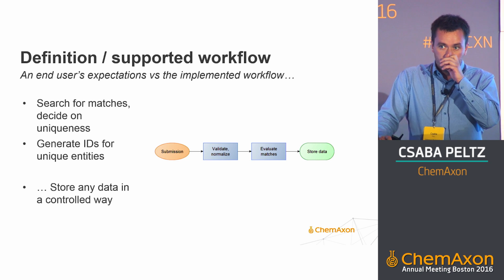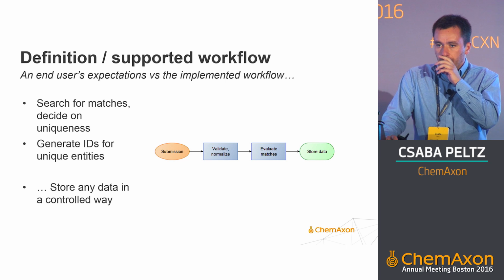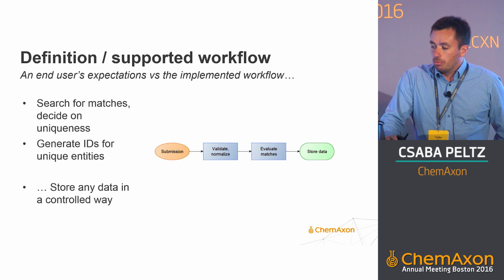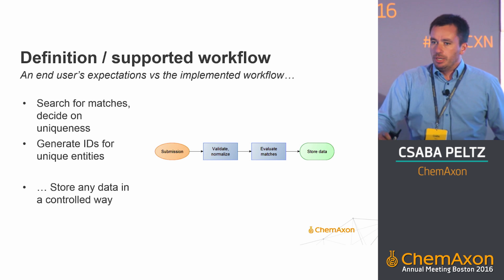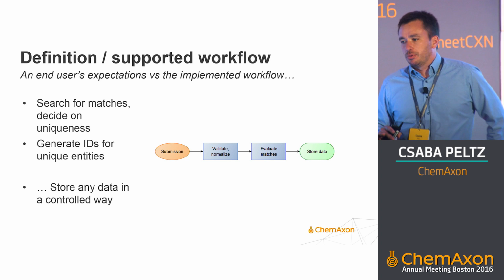I think most of us are familiar with it, but the most important thing to say right here is that registration is something that should be mostly hidden from the end user. So the end user doesn't want to take care about anything related to validation and normalization.